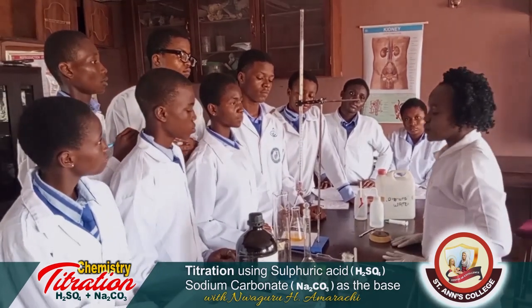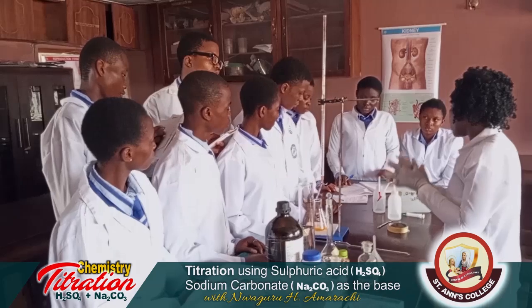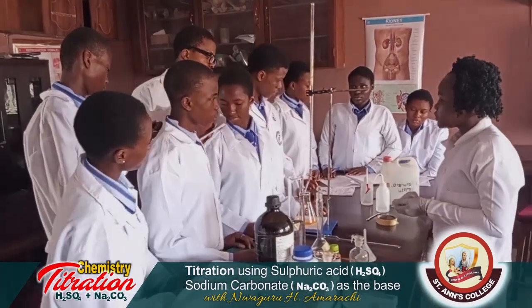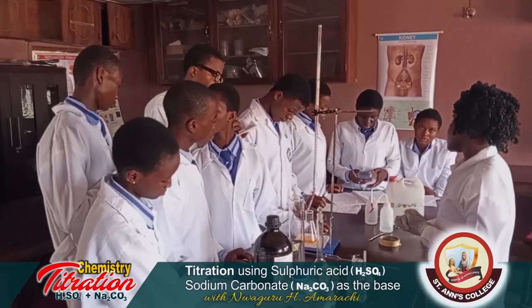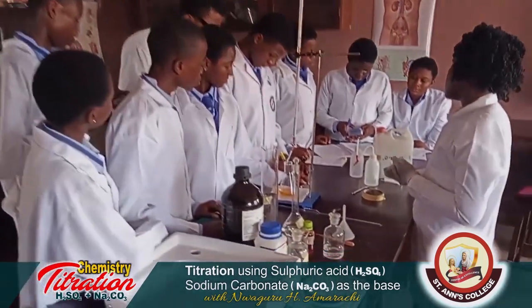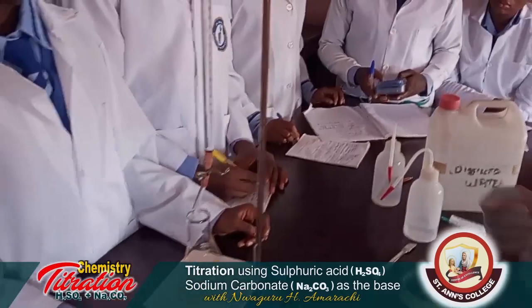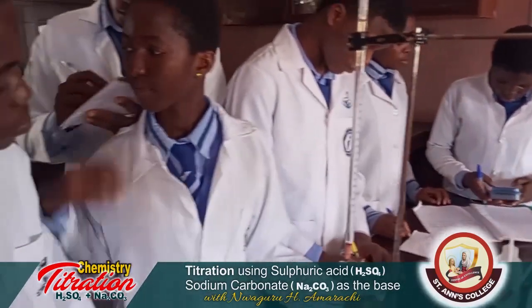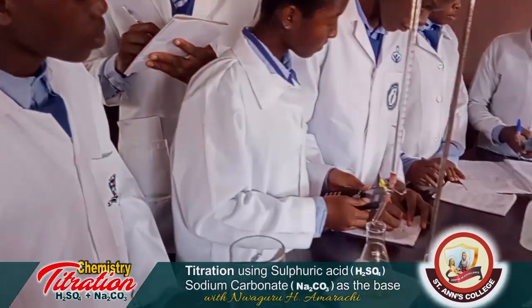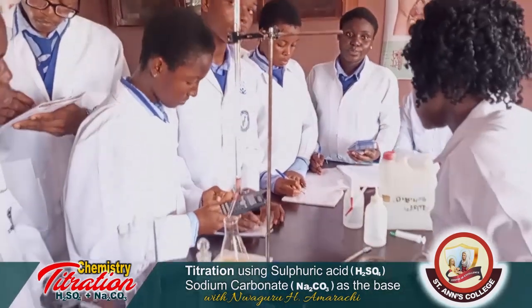Yes. Any other one? Let's add up to get the average titre of the acid used. So we have 20.50.